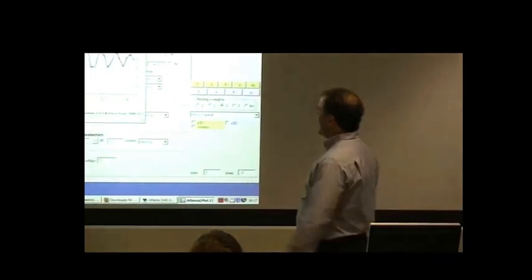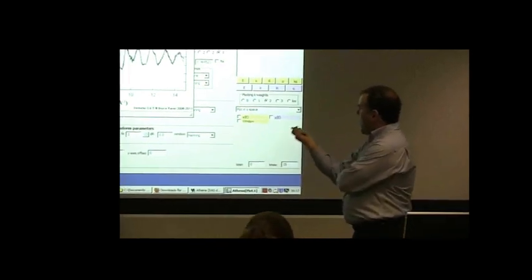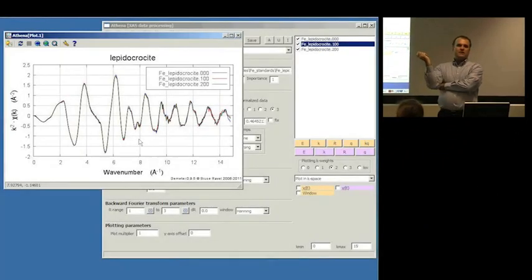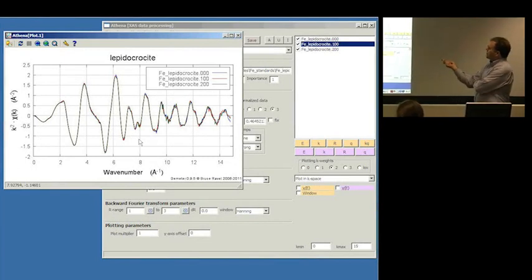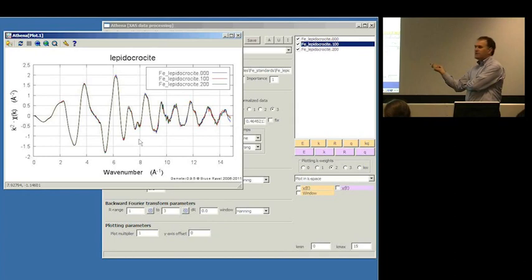The other thing about these data is that I would say I'm basically done measuring the data because the level of the noise is really quite small. Even amplified by the k-squared weighting, the level of the noise is really quite small compared to the level of the signal in these data. So 3 scans is probably overkill for these data.